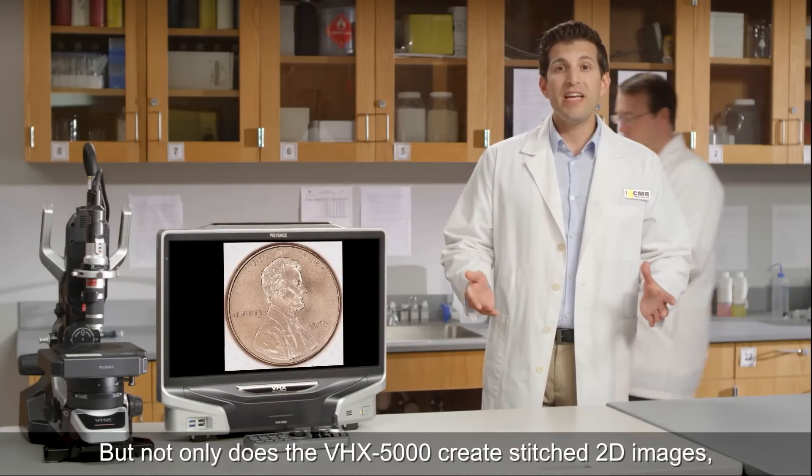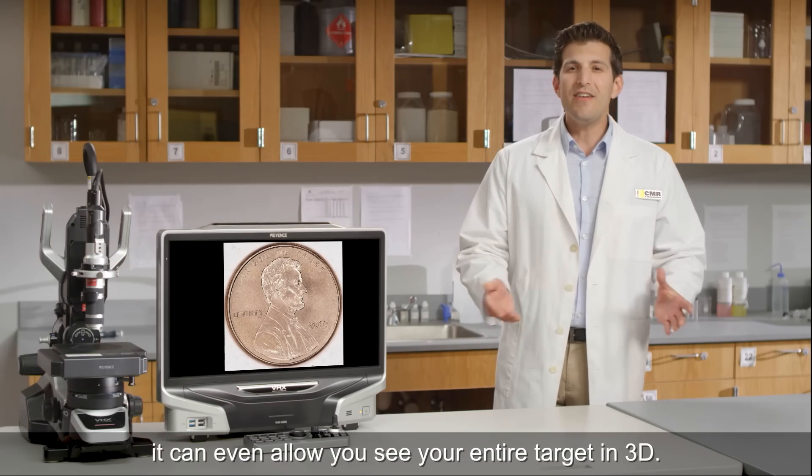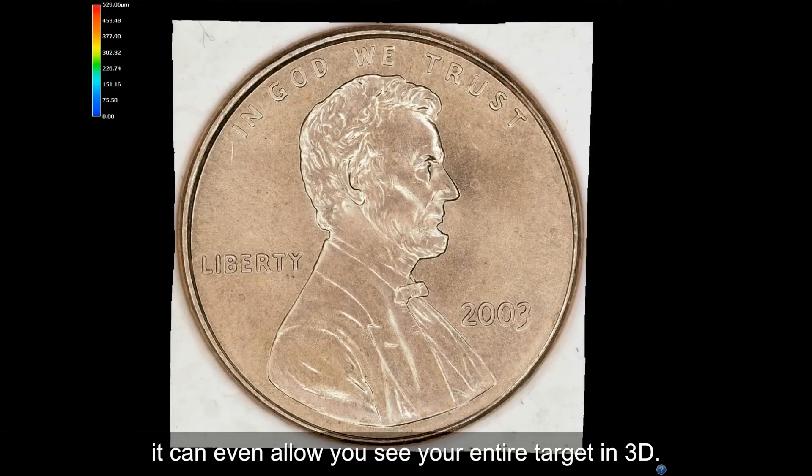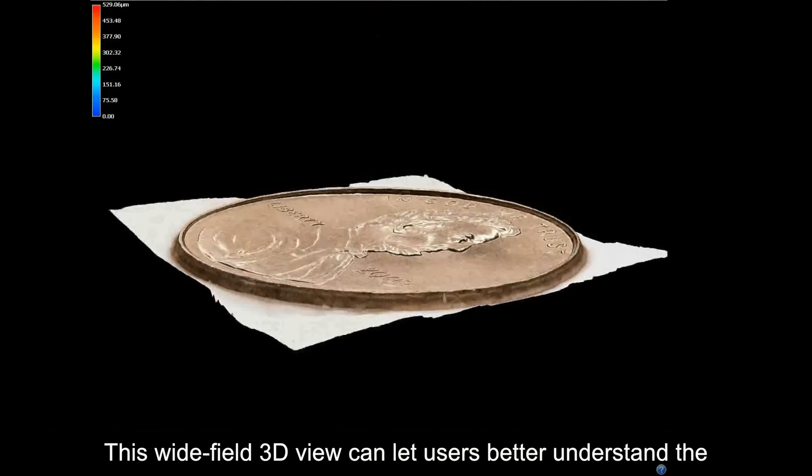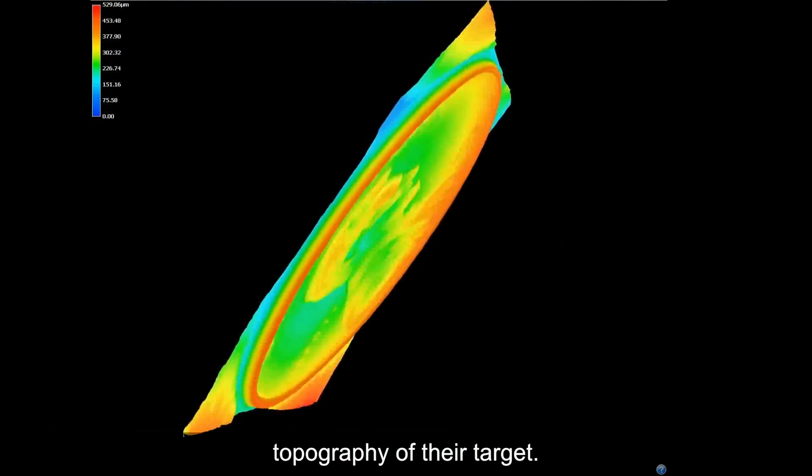But not only does the VHX5000 create stitched 2D images, it can even allow you to see your entire target in 3D. The wide-field 3D view can let users better understand the topography of their target.